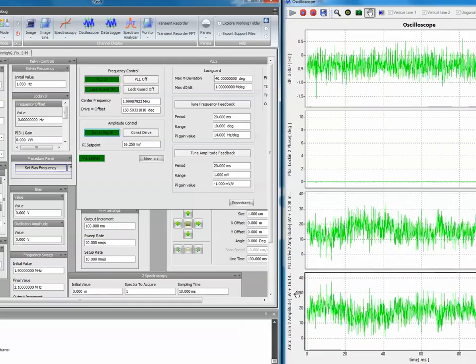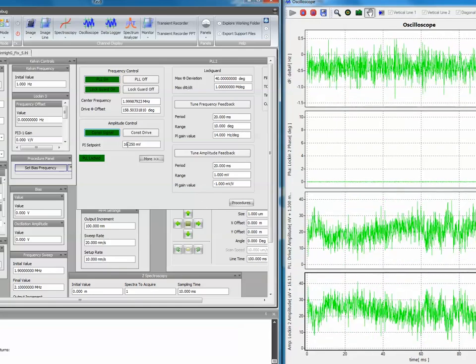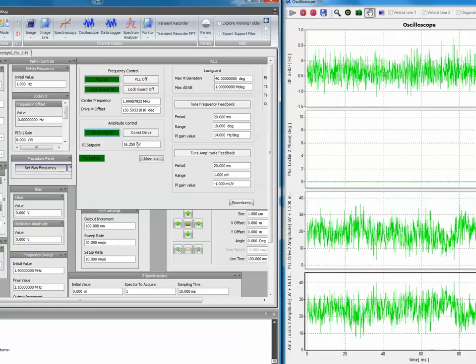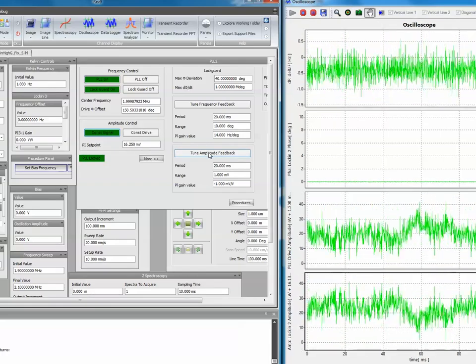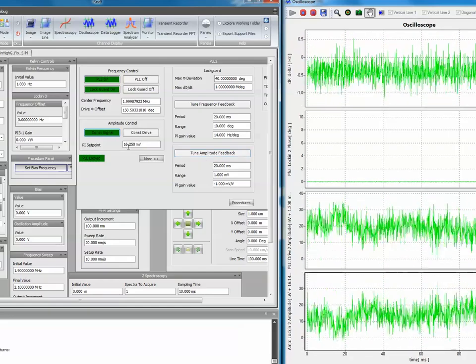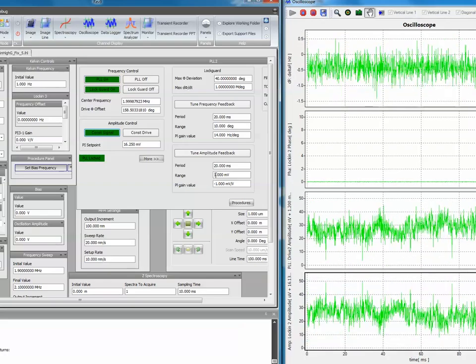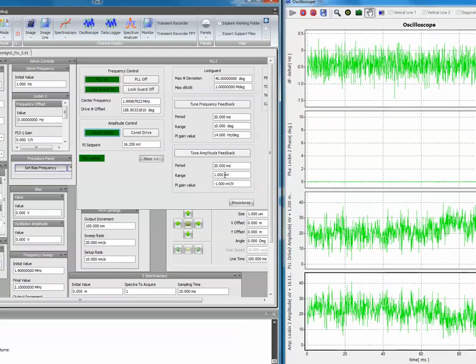And we see some detected amplitude, which is something like 16 millivolts, where the set point is set to 16.25 millivolts. Again, for this test, we will set the set point up and down by 1 millivolt. So right now the set point is 16.25 millivolts. It'll be kicked up to 17.25 and then back down to 16.25 millivolts.